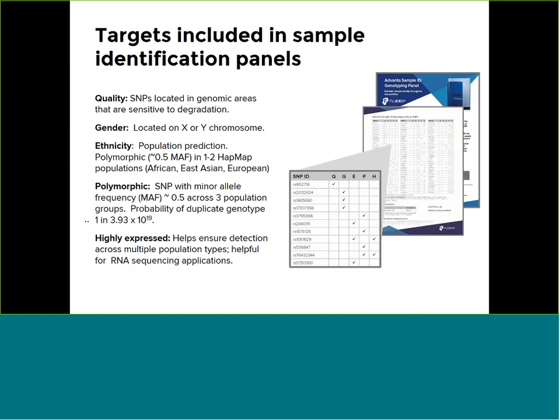Fluidigm released the SNP Trace panel that Jianhong was talking about, the one used in her lab, in 2014. That panel has also been adopted by many customers. And Jianhong has been using that version since 2015.